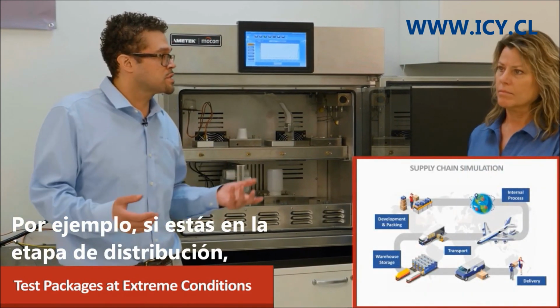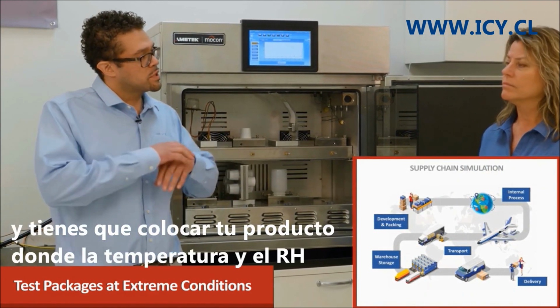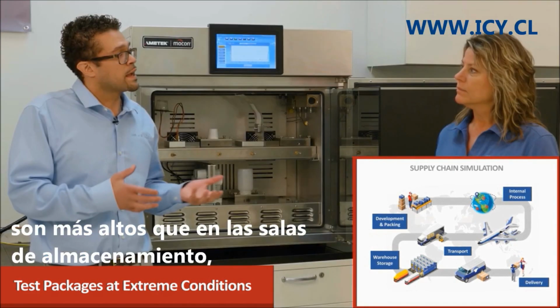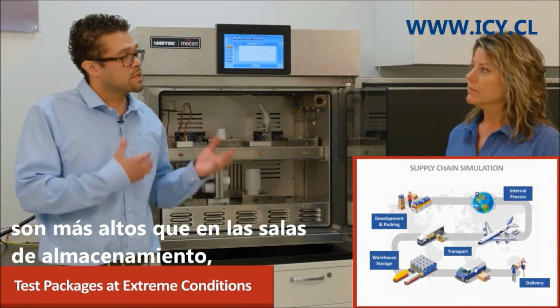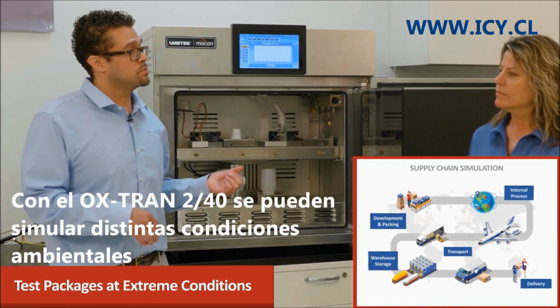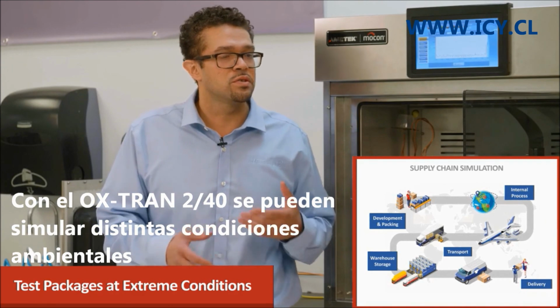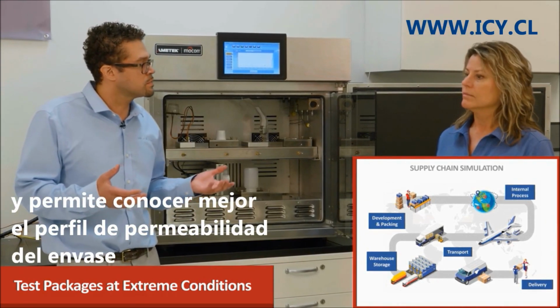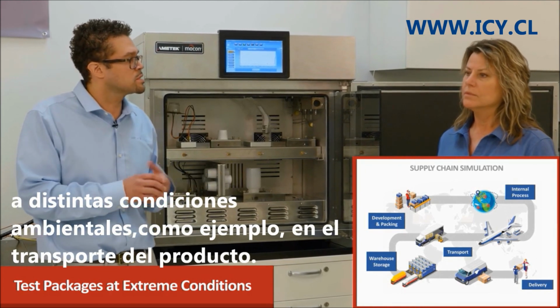So say you're in production and you want to distribute and you have to put your products on the back of a hot semi that has a high humidified environment and it's a lot warmer than, say, a store shelf. Sure. So this instrument allows you to simulate those actual conditions so you can better understand the rigors that are placed upon your package system during transportation of the supply chain.